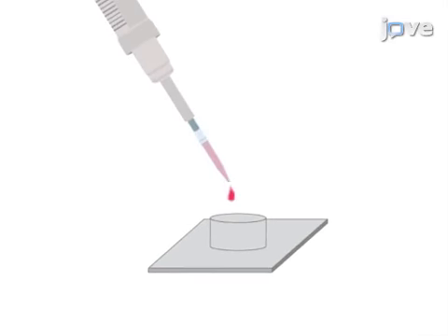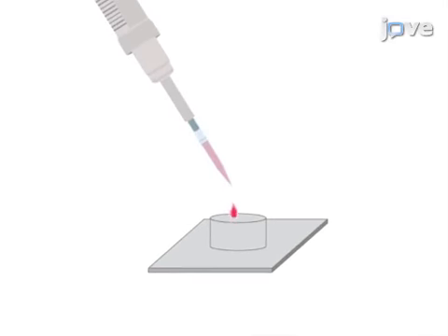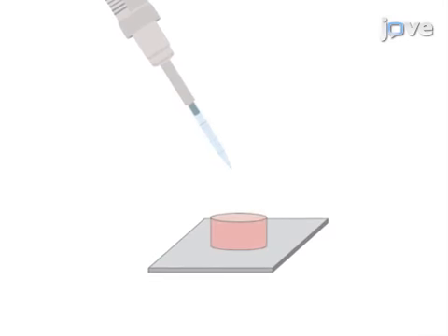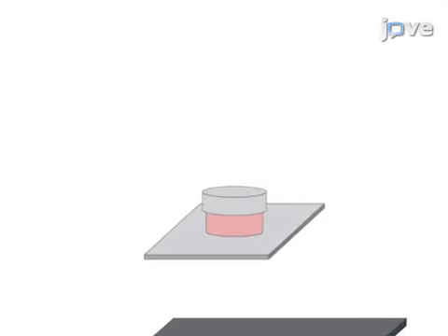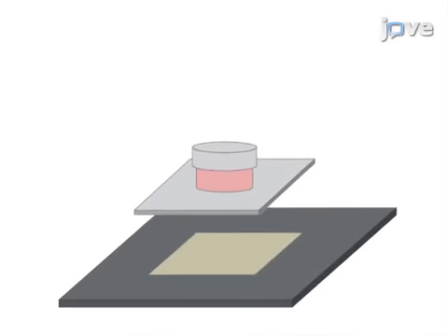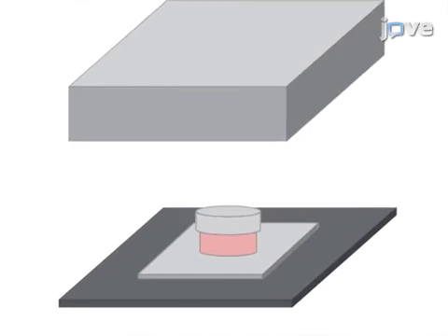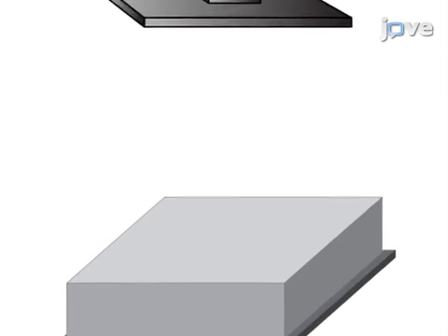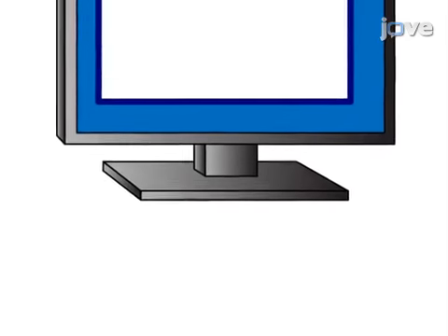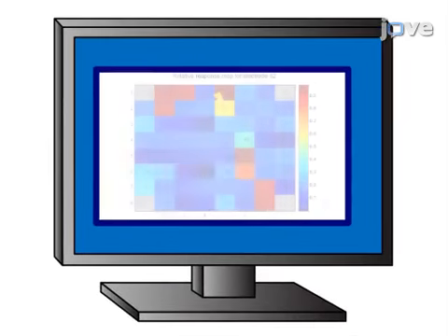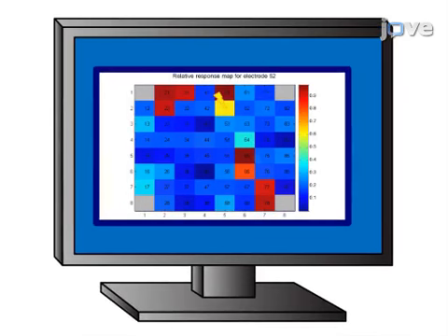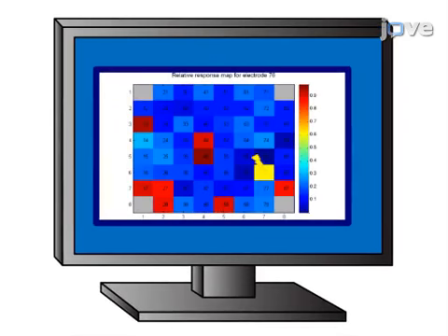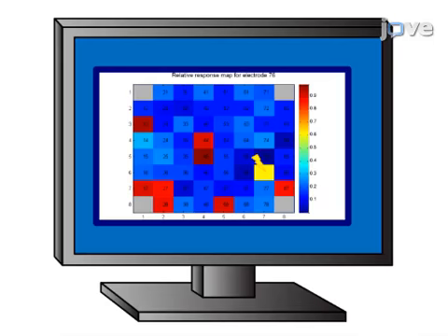This is achieved by preparing a neuronal culture over a microelectrode array in order to allow an experimental session of several hours without compromising cell activity. As a second step, a response map of the culture is computed which allows the selection of stimulating electrodes for the actual closed-loop experiment.